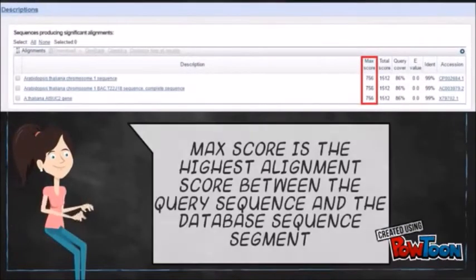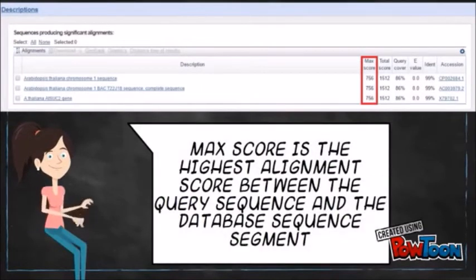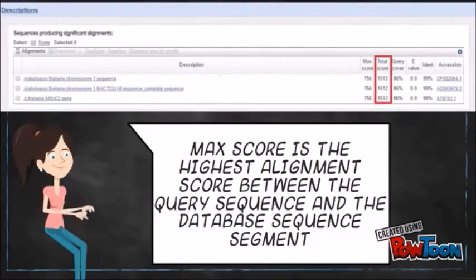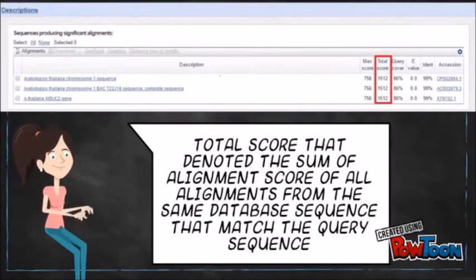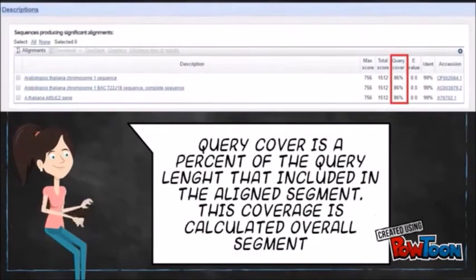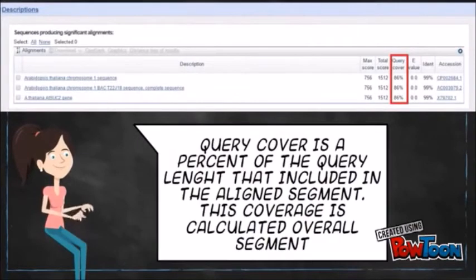Proceeding to the descriptions, Max score is the highest alignment score between the query sequence and the database sequence segment. Next to each column is the total score that denotes the sum of alignment scores of all segments from the same database sequence that match the query sequence. Query coverage is the percent of the query length that is included in the aligned segments. This coverage is calculated over all segments.